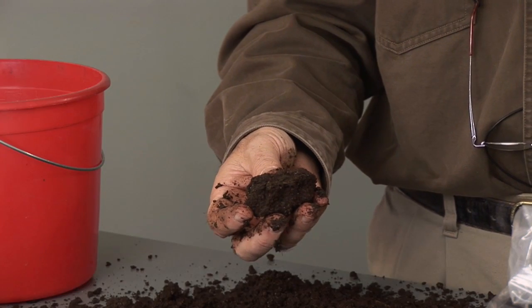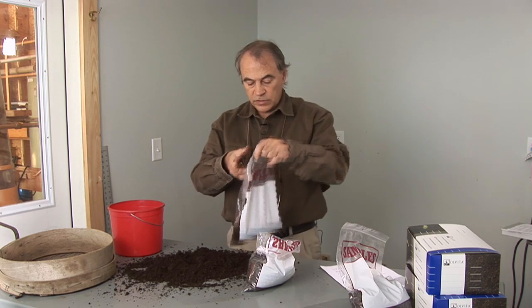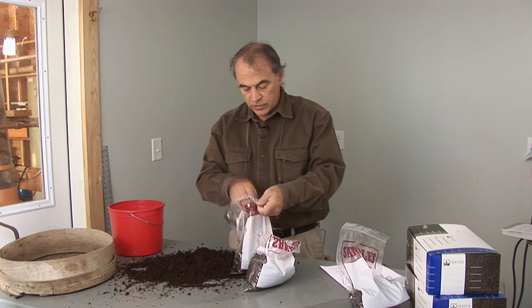Now let's consider a sample that's either too wet or too dry. Let's take a look at this sample here, which is a compost that was rained on.